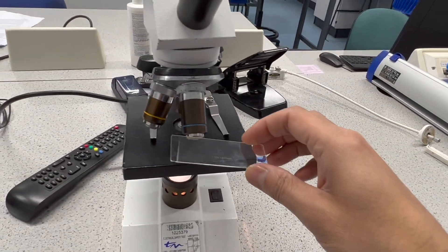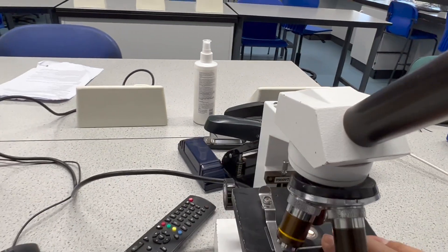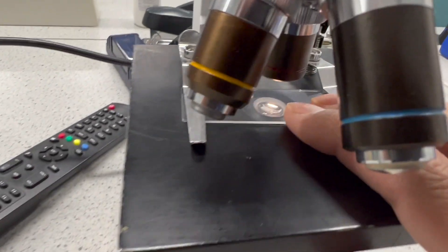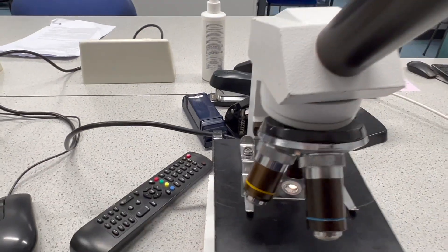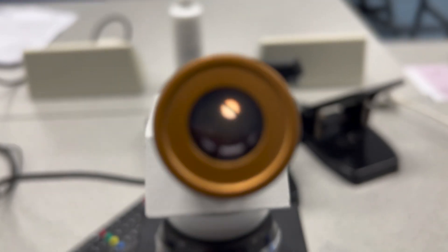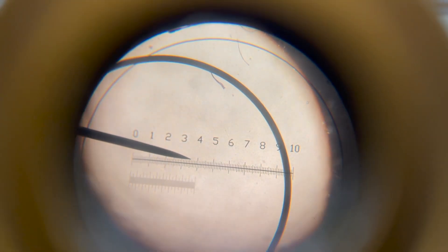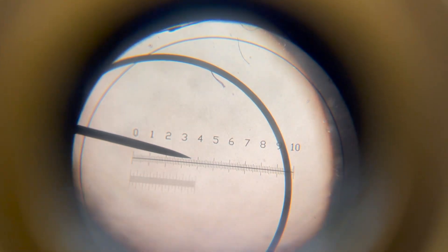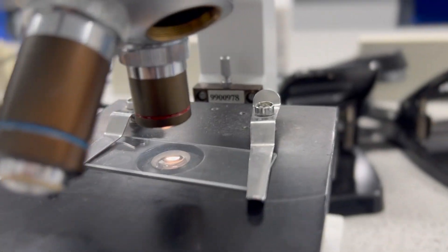I've set my stem slide to the side and placed the stage micrometer onto the stage, making sure that circle is right in the middle where the light comes through. I've spent some time lining up the two scales, and what I can see is that 100 divisions on the stage micrometer is equivalent to 40 divisions on the eyepiece graticule — and this is with the times four objective.